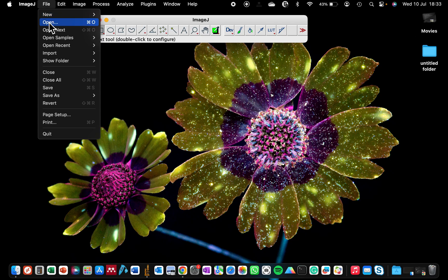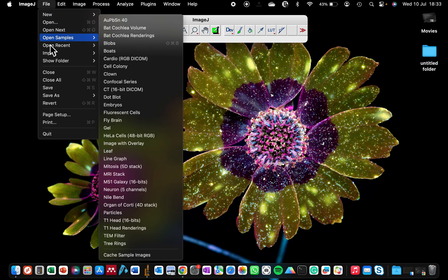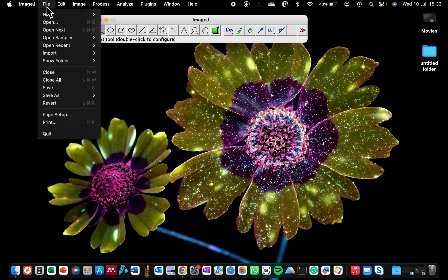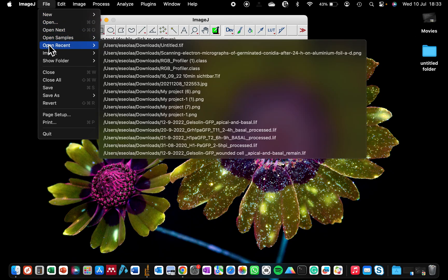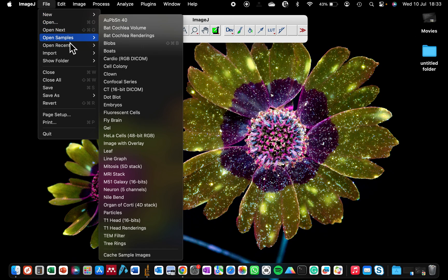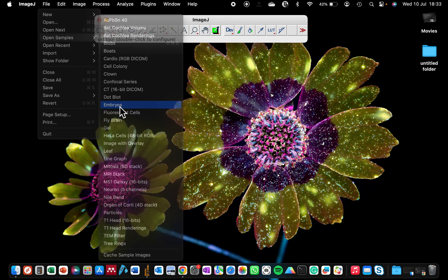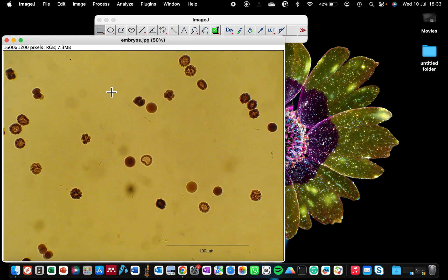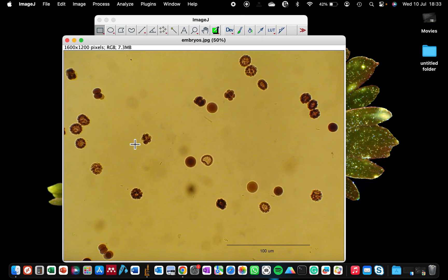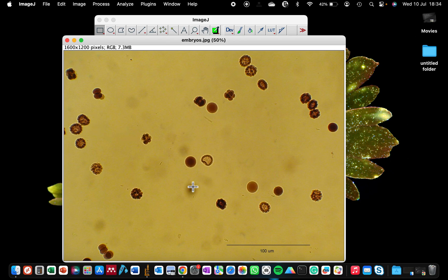Because I do not have any image that I want to use for today's tutorial, I'm going to be taking from the database of ImageJ by going to File, Open Samples. I'm going to be selecting the embryos cells. This embryos image shows different types of cells: the ones that have ruptured, the ones that are just about to be ruptured, and the ones that are still intact.